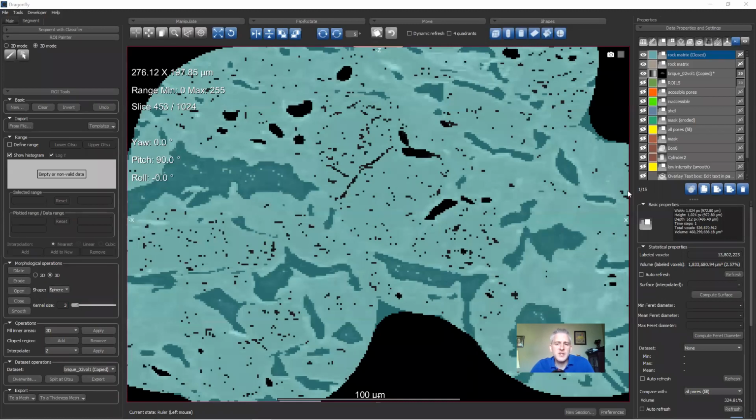This is not a 500 gigabyte data channel I imported. This is actually a 500 megabyte channel that I imported, and you see that I was able to process it. So I can point you in the right direction. You don't have to spend a ton on hardware. Like I said, you could spend the equivalent of $1,200 of today's money, or you could spend $2,000.